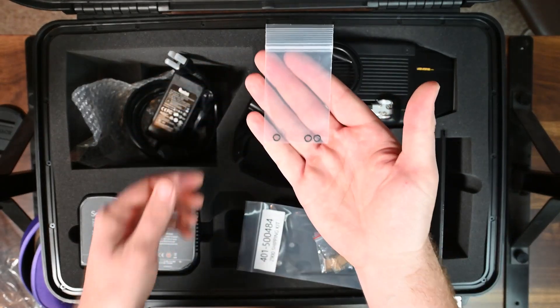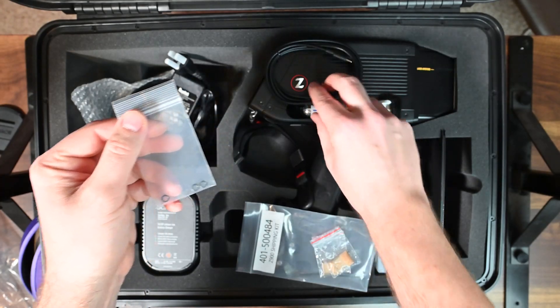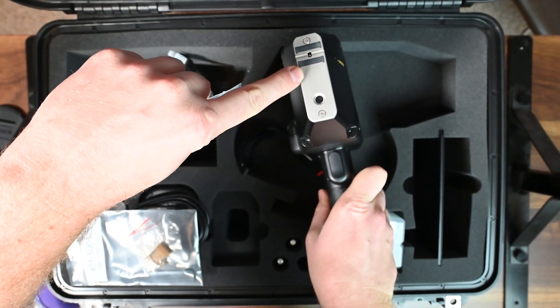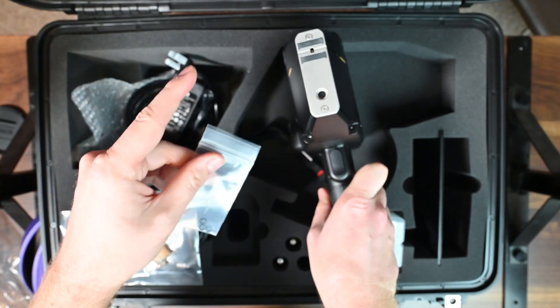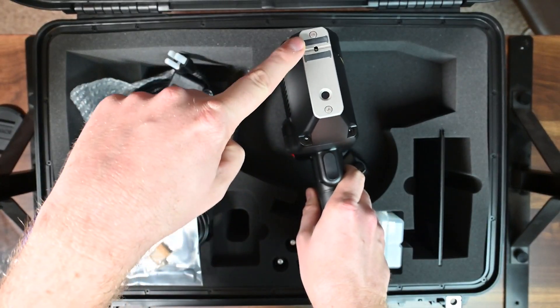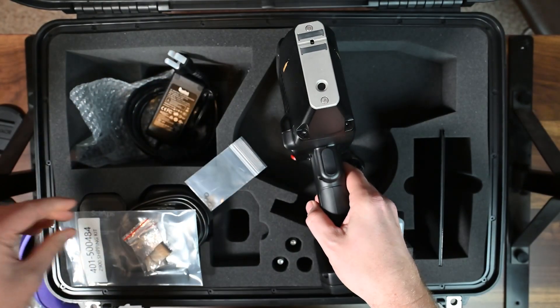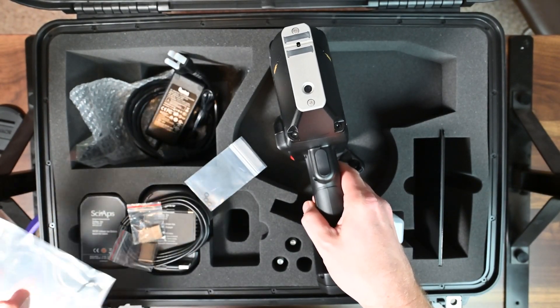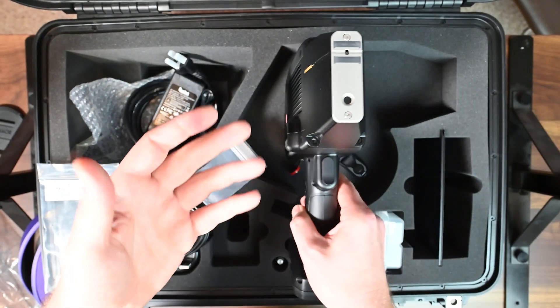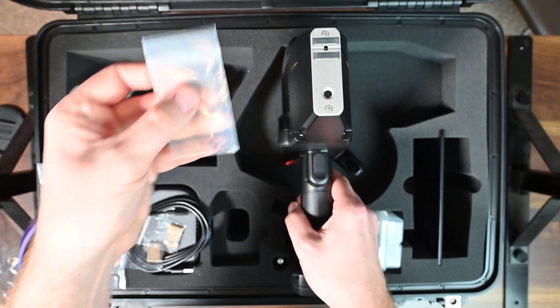These little gaskets — you might be tempted to think they go into the fixture where the argon bottle seats, but that's actually not true. They actually go behind the faceplate — there's a little fixture under the nose and those gaskets go there to help the argon flow from that location all the way up and out of the aperture. There are two Allen wrench screws on the nose, and the Allen key is included in that little pack. You can remove this faceplate to change the splatter shield and replace these gaskets with the gas feed system.